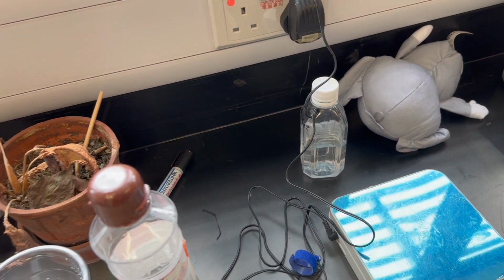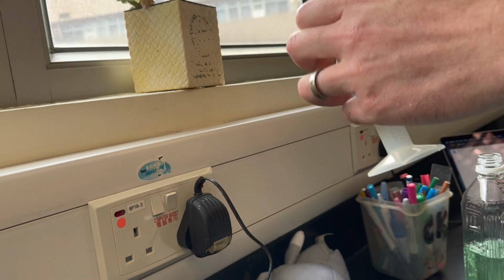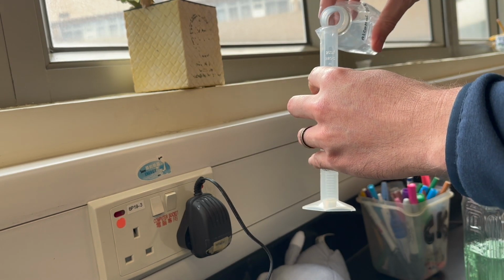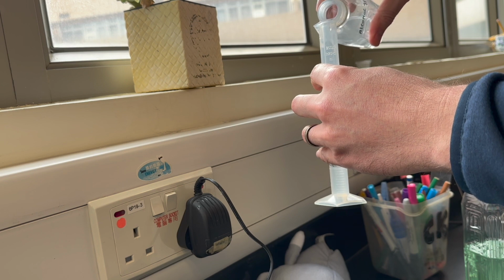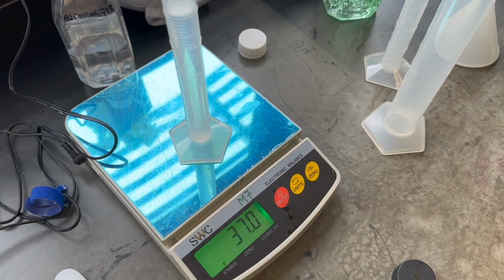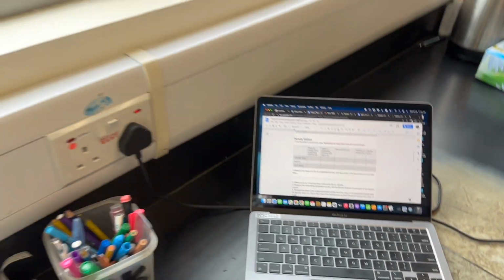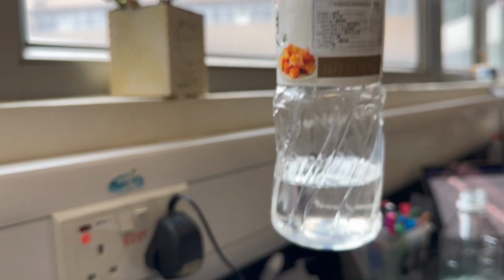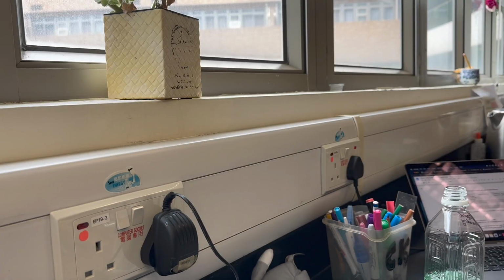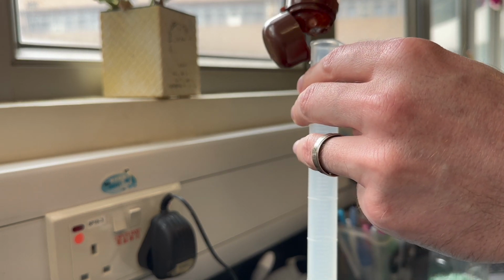And we'll go ahead and do the next one with rubbing alcohol, 25 milliliters. Okay, and there we go, 25. 37, so go ahead and write down 37 right here for alcohol. And then the corn syrup. Now this is extremely thick stuff, so I'm going to do my best here to pour it. All right, it's slowly making its way.